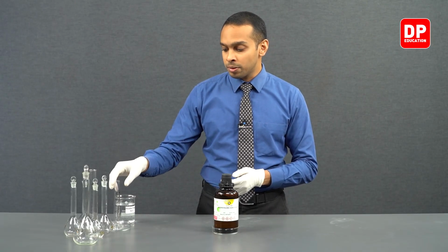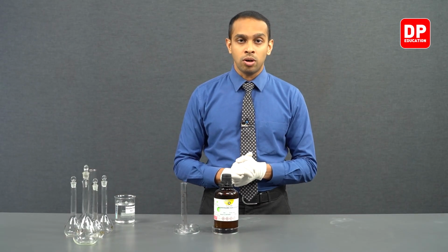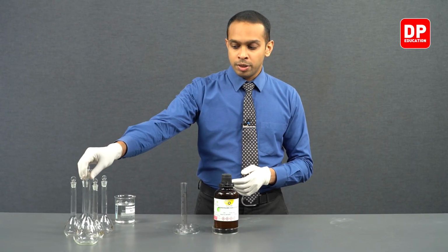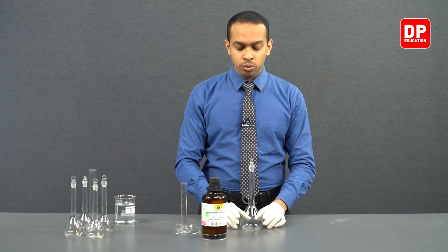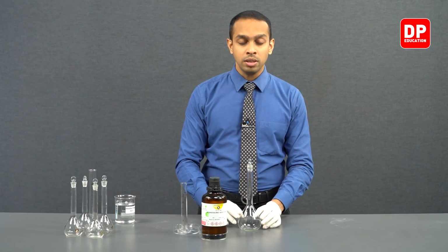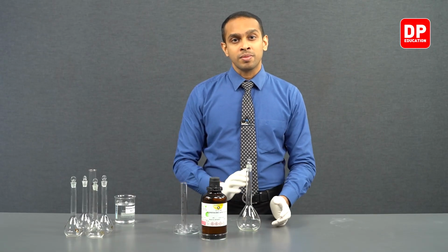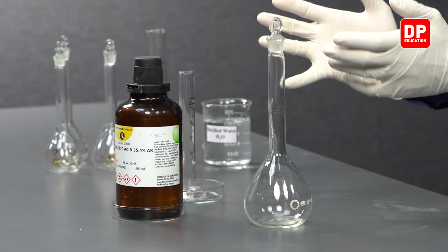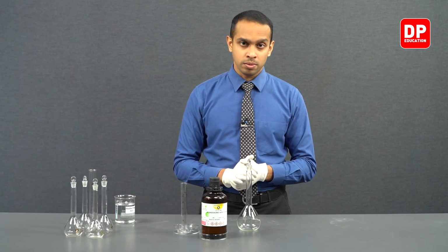So we are going to be using a measuring cylinder to measure 21.5 cubic centimeters of HCl. After that, we will be transferring that amount of HCl into a volumetric flask, and then we are going to add water all the way up to this calibration mark and mix it really well and finish preparing our 1 mole per decimeter cube concentrated hydrochloric acid solution.